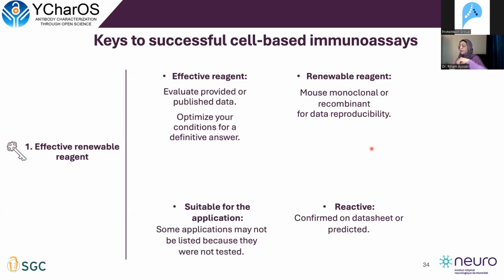Additionally, for a reagent to be effective, it must be suitable for the assay and, of course, reactive with the sample species that you are using. And keep in mind that, as I showed in our statistics, some applications were not tested by the manufacturer. However, the antibody may still be investigated for its suitability for a certain application.